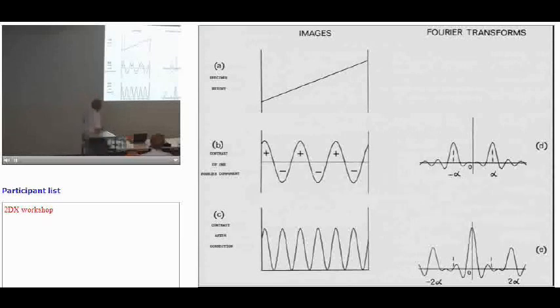And if you look at it in the electron diffraction pattern, you had your diffraction spot, but you've multiplied by this contrast transfer, or tilt transfer function, as we called it. You multiply the projection by the tilt transfer function, and its Fourier transform is then the convolution of your original Fourier component of the image, which would be a spot at that position, with the Fourier transform of this, which is three sine waves, and that then creates a peak at +3 and -3 pixels, because you've got 3 Fourier components across it. So instead of seeing your nice diffraction spot, it's split into the 2 Fourier components.